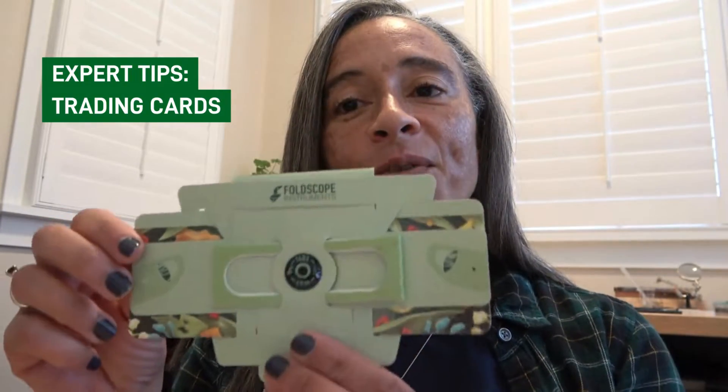The Foldscope 2.0 changes not only the way that we view and use microscopes, but also the types of slides that we can use for sample preparation. When you look at your Foldscope 2.0 and you turn it to the back, you'll notice that the slide pocket is much bigger than that of the original Foldscope. This is to accommodate our new and innovative type of slide called a trading card.